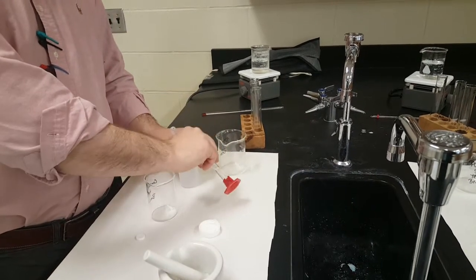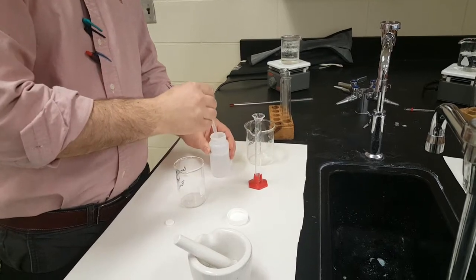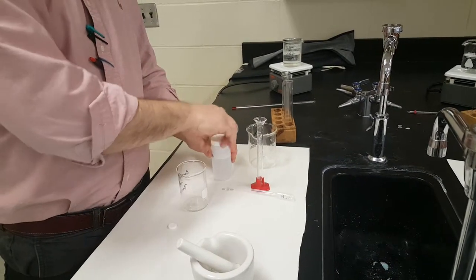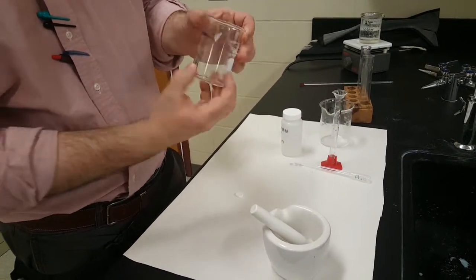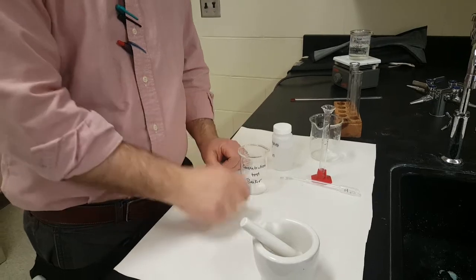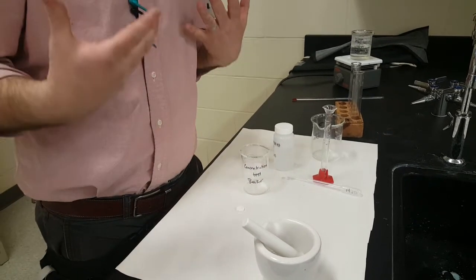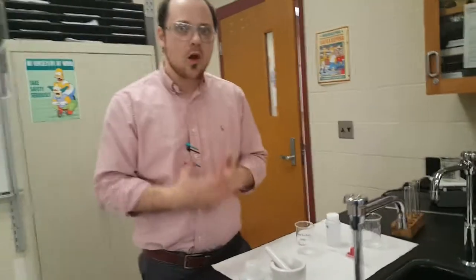I'm not going to do the whole thing for you because that's your job. Once you've got 20 mils of the concentrated acid, you're going to add it into the beaker. Toss your tablet in. Count, time, check it out, and see how long it takes for the reaction to stop bubbling. That's how you know the reaction has completed.